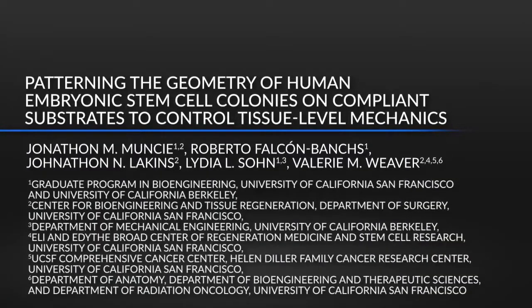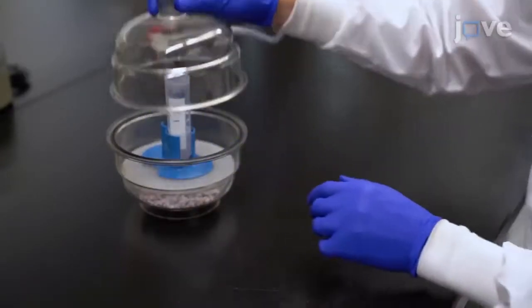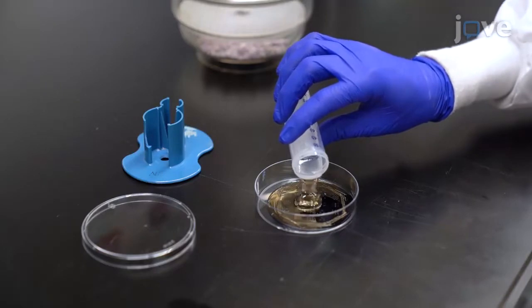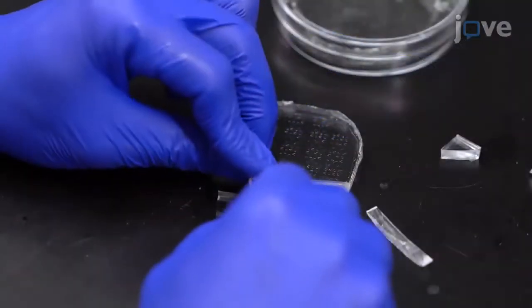This protocol allows researchers to culture stem cell colonies on hydrogels with complete control over both the stiffness of the hydrogel and the geometry of the colonies. The main advantage of this technique is that it allows researchers to culture stem cell colonies in conditions that better mimic the physiological environment than tissue culture plastic.